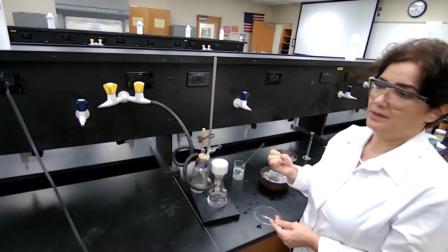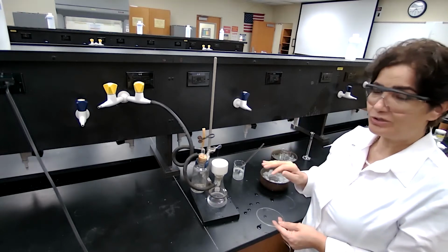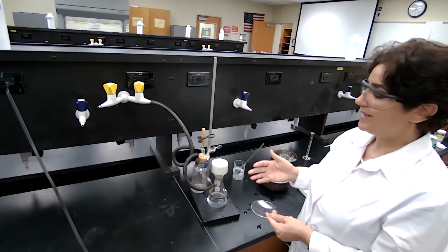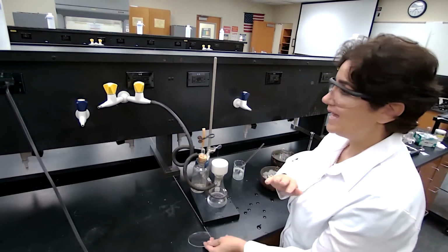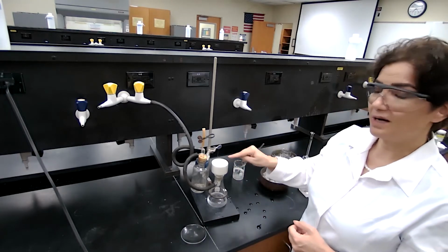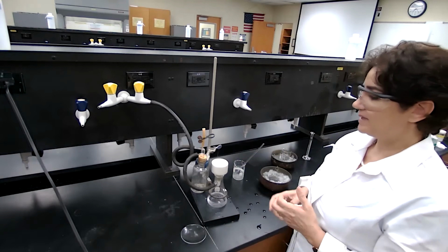Air drying, however, if there is opportunity for air drying, is going to work the best, because we are avoiding any possibility for melting of the sample inside the oven.